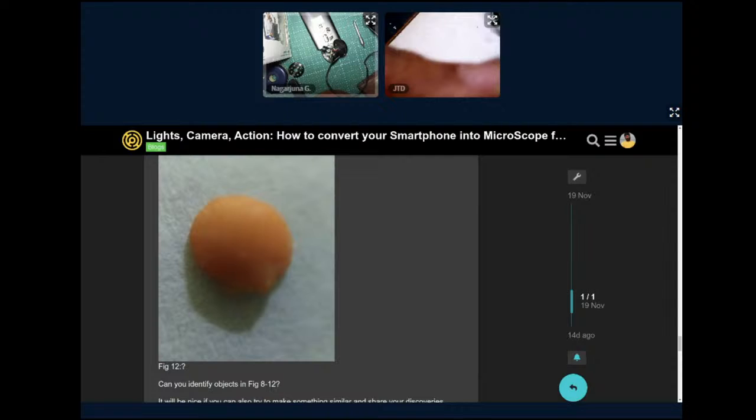Can you see there is a blur at the center? There is a light falling on it. So at the center of this entire picture there is blur because that 2 mm lens is so small that it's not covering the entire lens of the camera. Correct. So from the margins, it is collecting the other information.